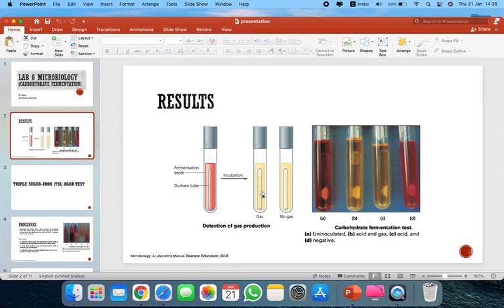In fermentation, the nutrition contains sugar, so fermentation of the sugar will produce an acid product. Sometimes, besides the acid products, there is also gas, because some bacteria can produce gas, and others may form both acid and gas.